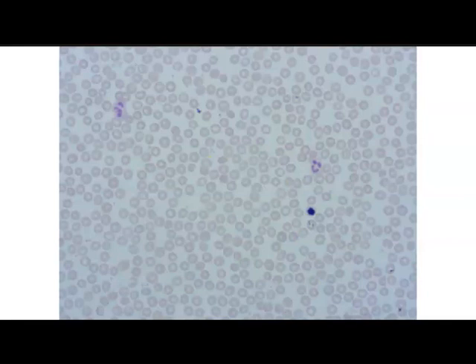Next slide. So this blood smear, we can see more red blood cells, multi-lobed nuclei of the neutrophils. Here's a neutrophil, there's a neutrophil. Again, neutrophils being the most numerous of the white blood cells. Never let monkeys eat bananas. Here's a large neutrophil, just a close-up of a neutrophil with a multi-lobed nucleus. Kind of look like weird sausages. And then you have your red blood cells. More neutrophils, red blood cells. This might be a lymphocyte. Here again, we see a monocyte and a lymphocyte.